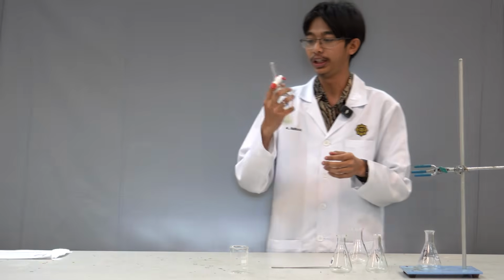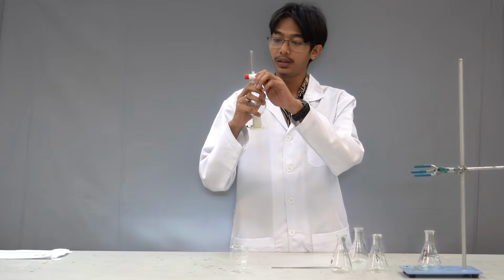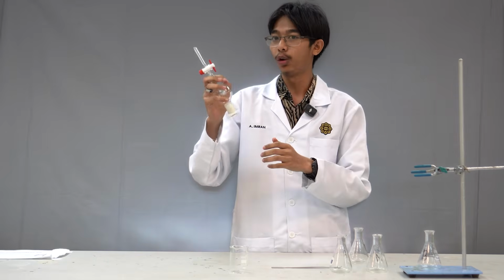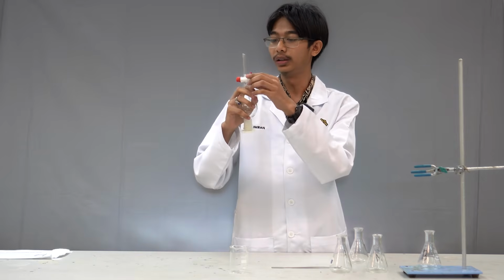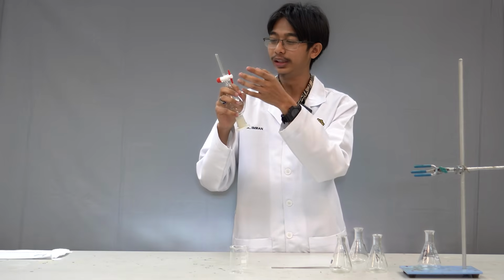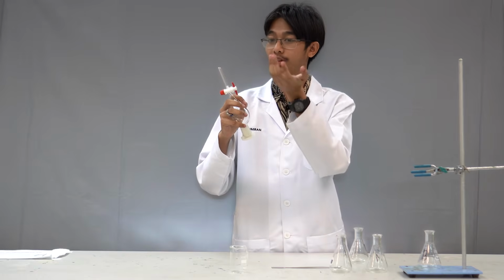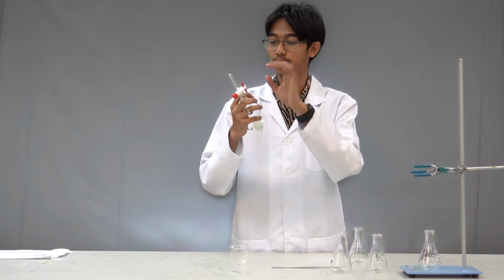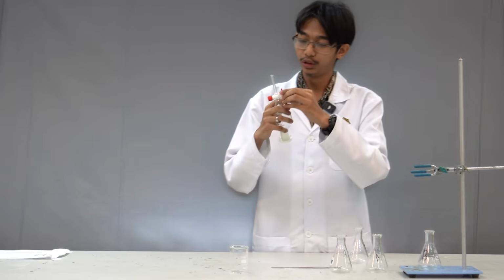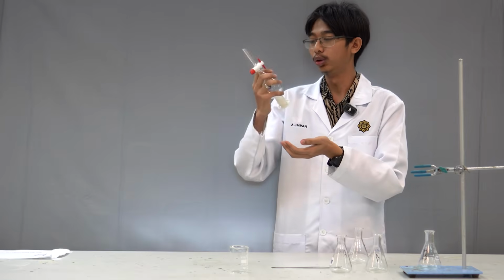You just give it a shake. And remember to occasionally open it. You stop for a while, then you're going to open it. Do it slowly, just give it a little nudge. Then you're going to hear a pop sound or hissing sound, depending on how fast you open it. This is going to relieve pressure, because there's going to be pressure build up when you shake it.